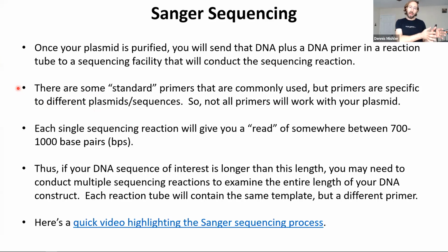You could have one plasmid that's really standardized and that people use a lot, and it could have completely different sequencing primers than another plasmid that people use a lot. So you just have to be aware of that. Commonly though, my students will also design our own sequencing primers because we might be working with a specific DNA sequence. So it just depends.